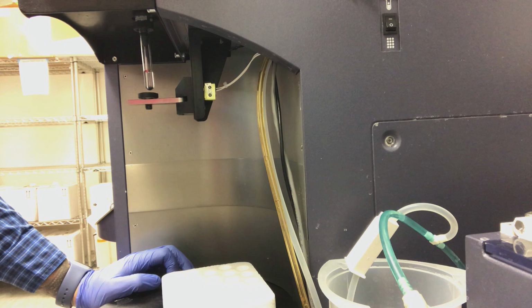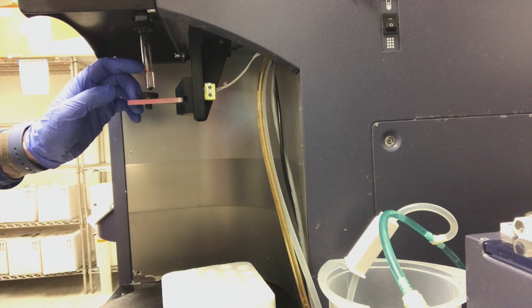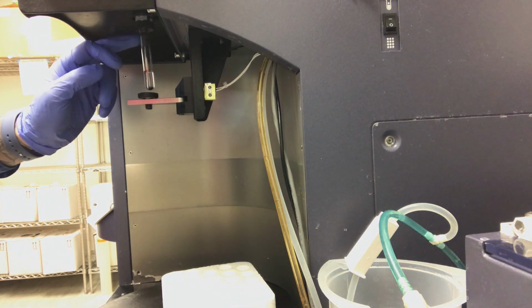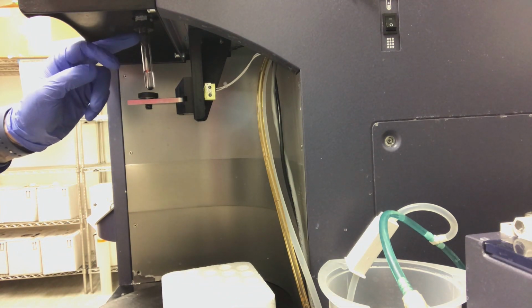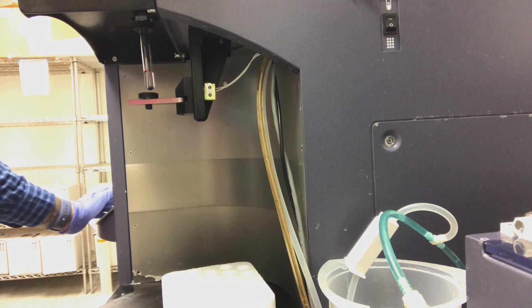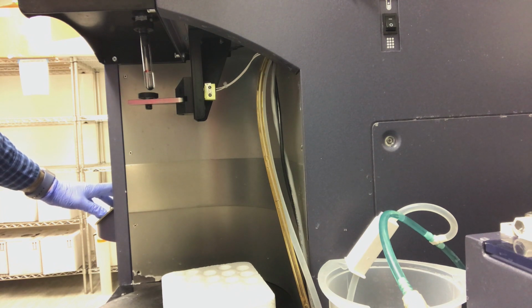make sure that the water level is higher than the initial bleach level that you put in, but not so as to touch any of the plastic or the rubber fitting at the top of the probe. Then switch the speed, the flow rate, back to low or medium for when you're running your samples.